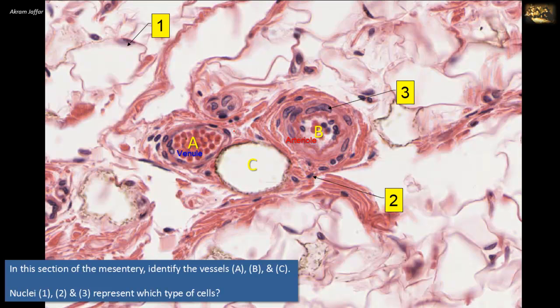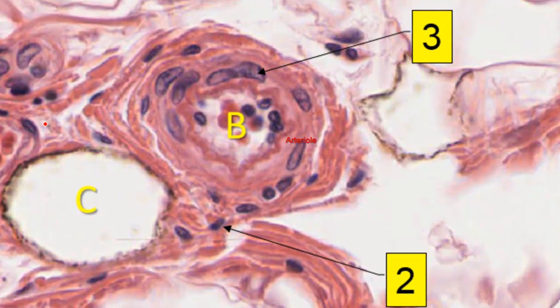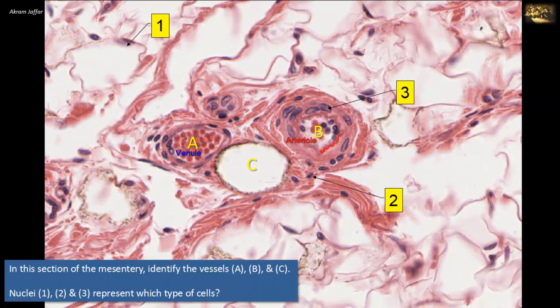In addition, this nearby arteriole, B, also has an internal elastic lamina, which is represented by the dark wavy line here. This is a feature present in large arterioles. It is shown here, so we are quite sure that this is an arteriole. The tunica media of the arteriole has more smooth muscle cells in its walls, 1 to 5 layers. You can see that it is clearly thicker than that of the nearby venule.